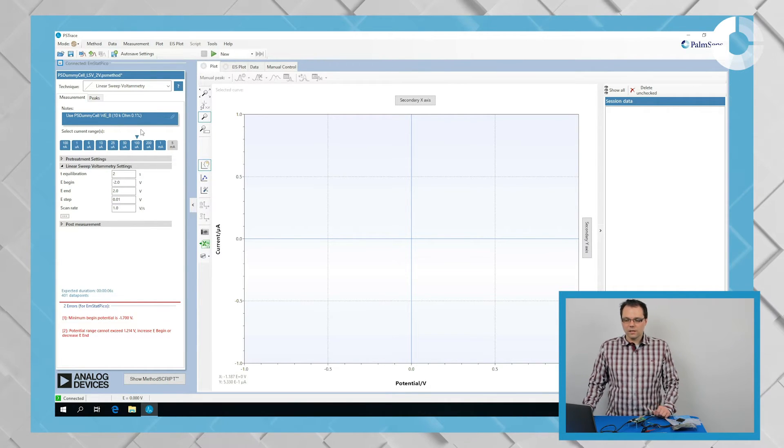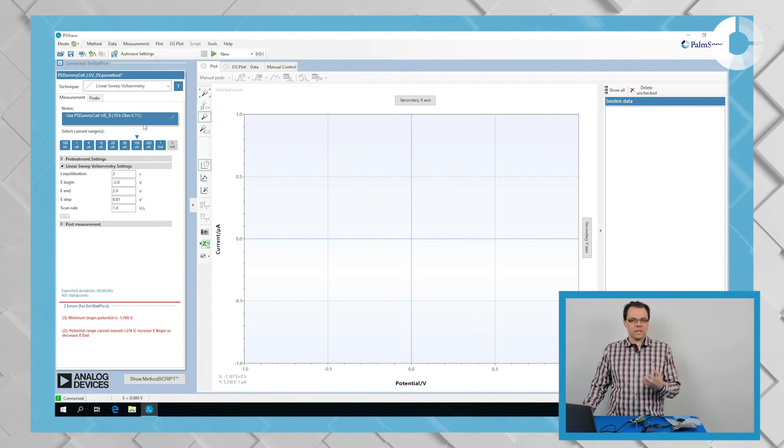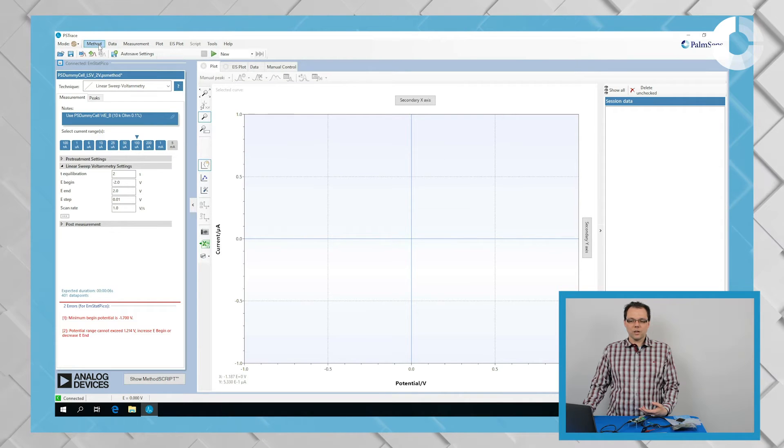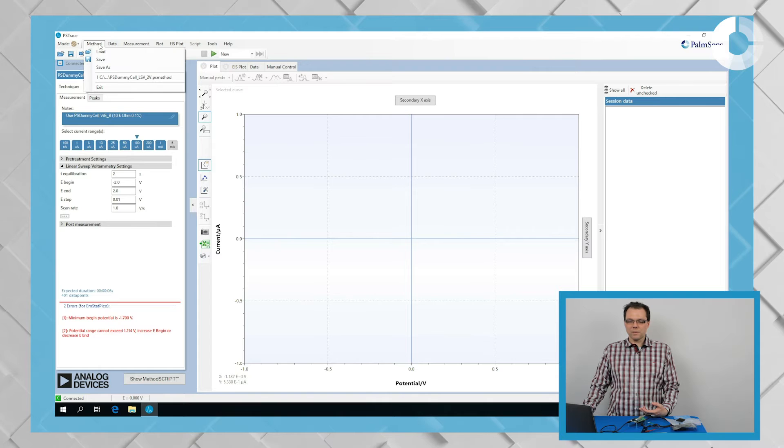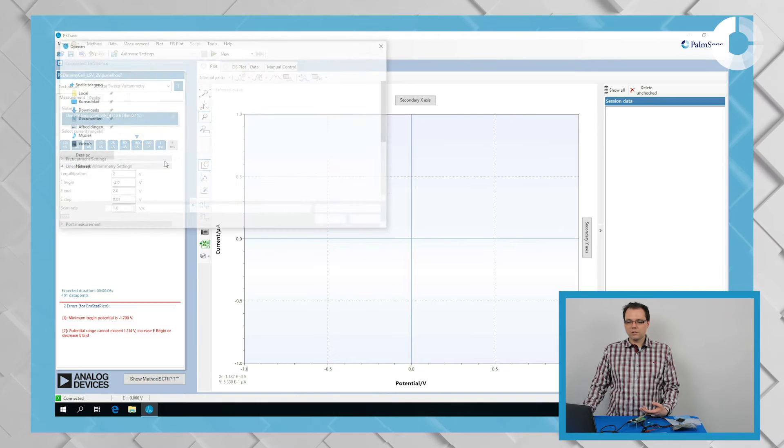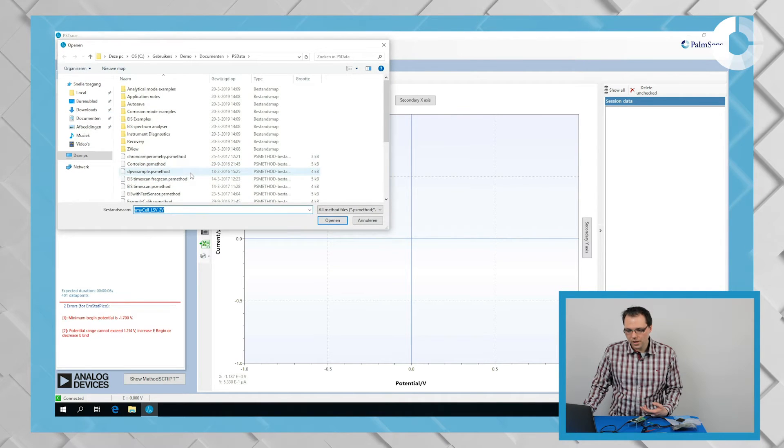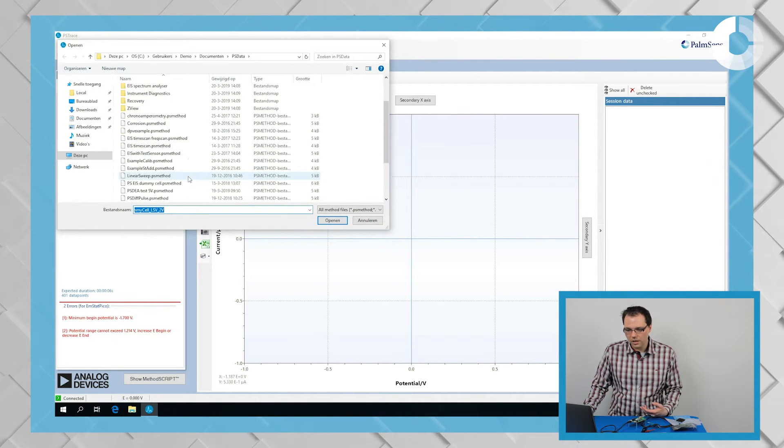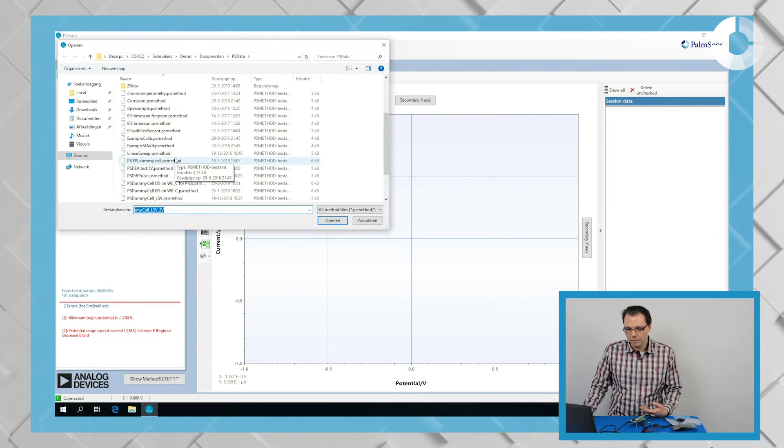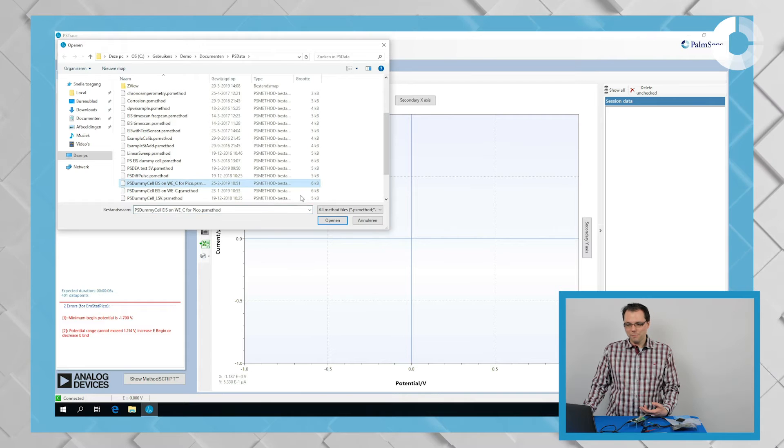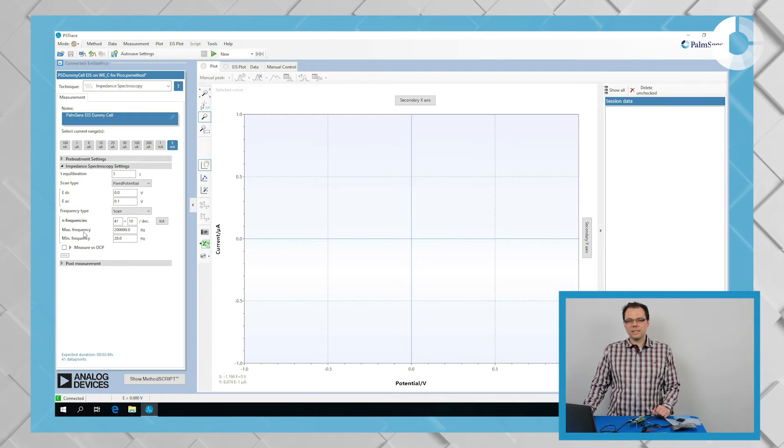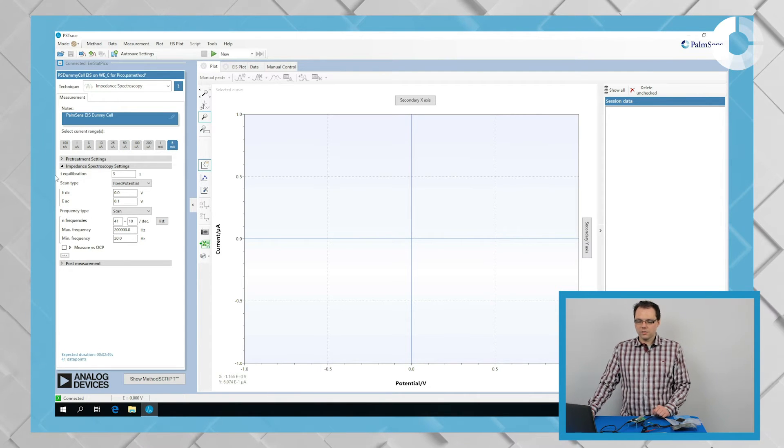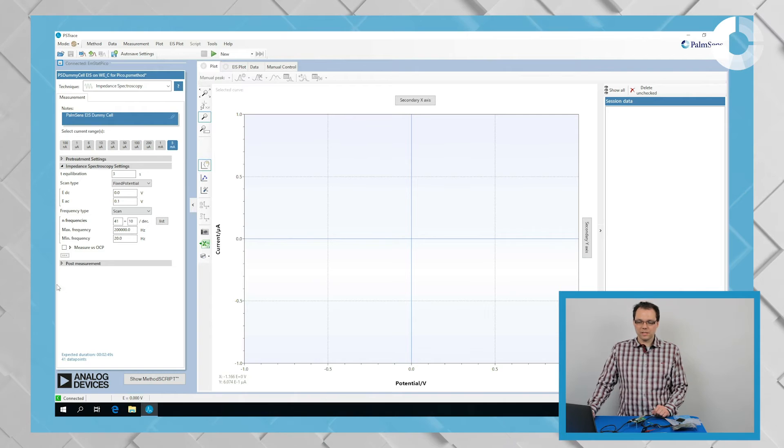Well, in this video, just for saving some time, I will load a set of method parameters so that we can just start with our measurement. You can easily do that by clicking on method and then load a method file. So we're looking for PS dummy cell EIS on WEC for Pico. And we're opening that one. And all the measurement parameters we need are already loaded into the method editor.